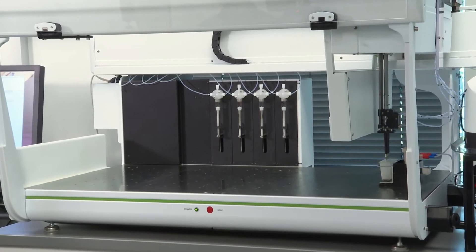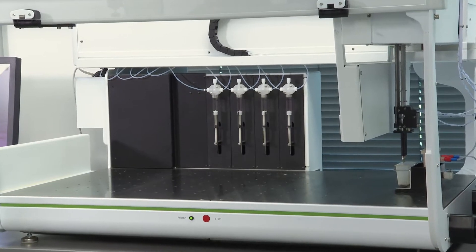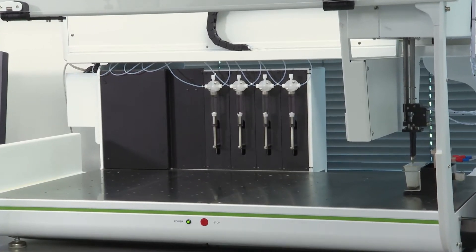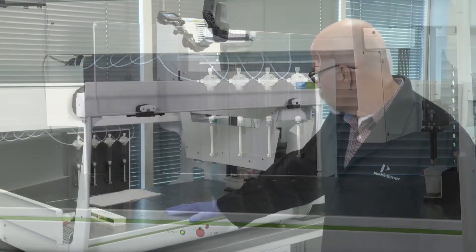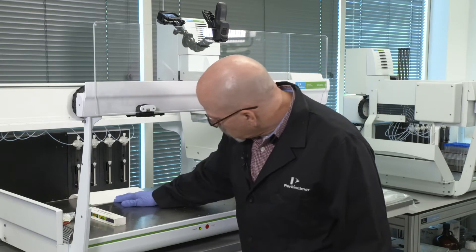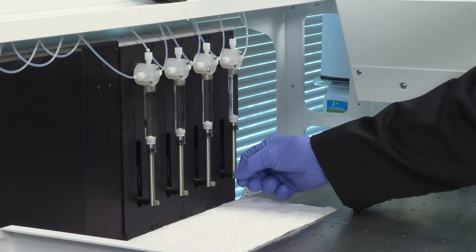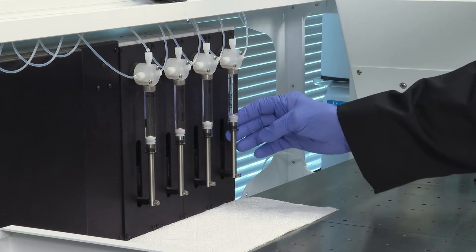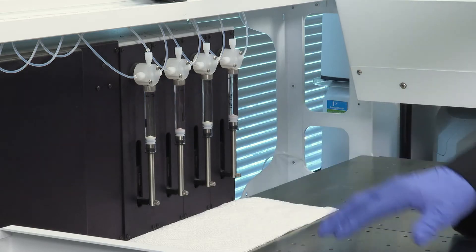You'll see that the syringes move down. This is to allow you to unscrew the syringe and remove it from the four-port valve. Once the arm has moved out of the way and the pump has moved down to the lower position, you're ready to remove the syringe, check it, and replace it if necessary.